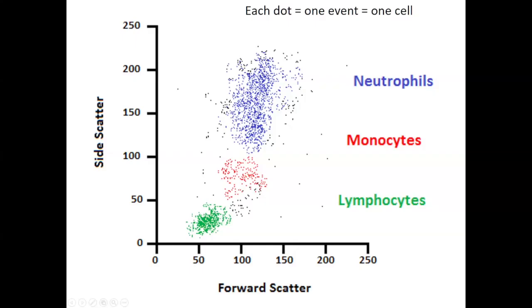So I repeat these terms, maybe where cytometrists use these terms, population, clusters, events, it all means the same. This is the actual points behind that. Okay.